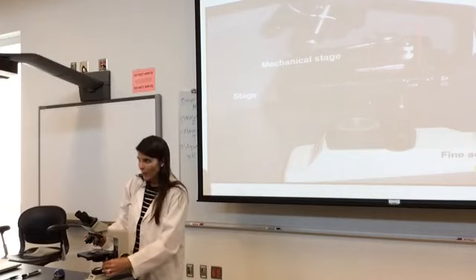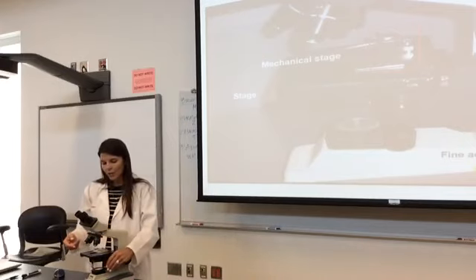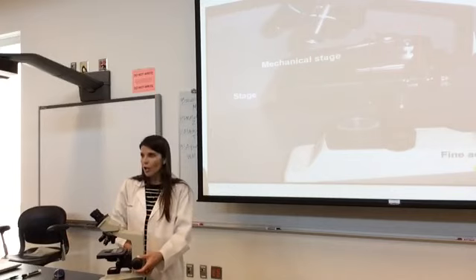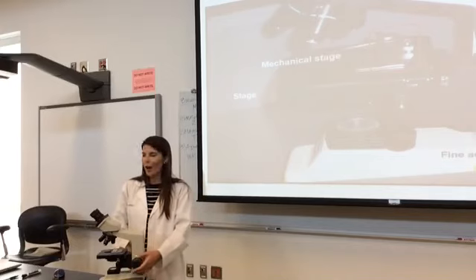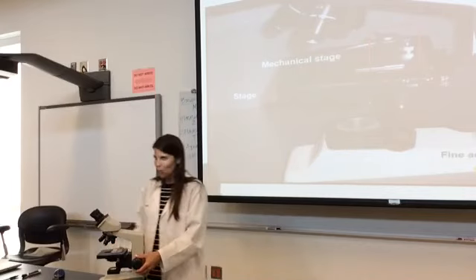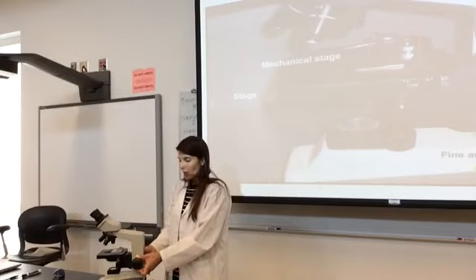So if you begin to use your adjustment knobs, you will see that. Okay, so that's your mechanical stage. Then you have these large knobs, and these are the knobs that everybody always wants to touch first. Okay, because I guess they just have that appeal to them. They just say, grab me. These knobs, the ones that are more medial, the large ones, we call them the coarse adjustment.